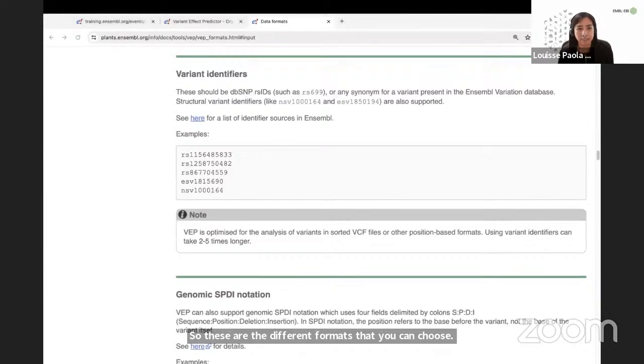Now, from our example in the slide, we have 3 variants, and we didn't have them in the right format. So what we did is we put them in the right format for you, and I will paste that into the chat. In the chat, you'll see that this is the VCF, the variant calling format. So we have the chromosome, the position, we've given it an ID, the reference allele, followed by the alternative allele.